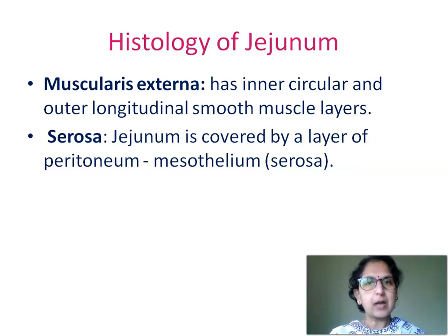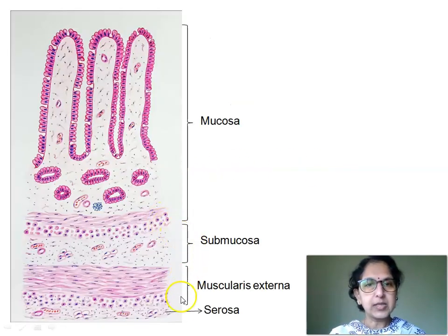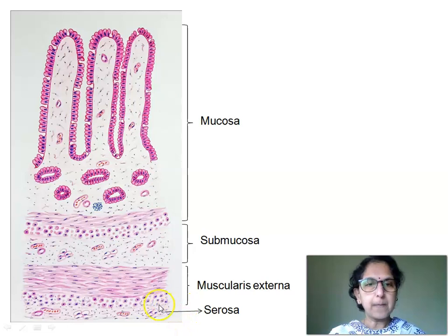The outermost layer is the serosa. Jejunum is covered by a layer of peritoneum — mesothelium — thus showing the presence of serosa. The muscularis externa shows inner circular and outer longitudinally arranged smooth muscle fibers, and the outermost layer is the serosa, having connective tissue, blood vessels, adipocytes, and nerve fibers.